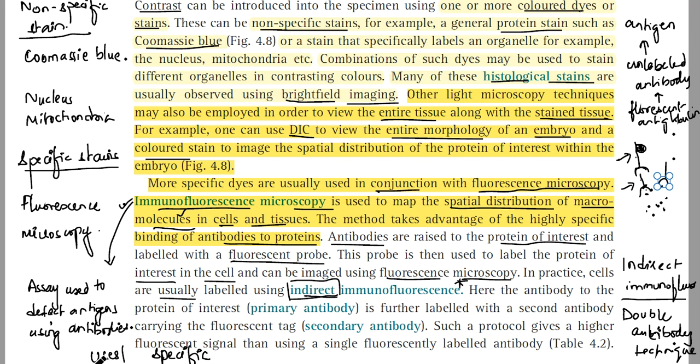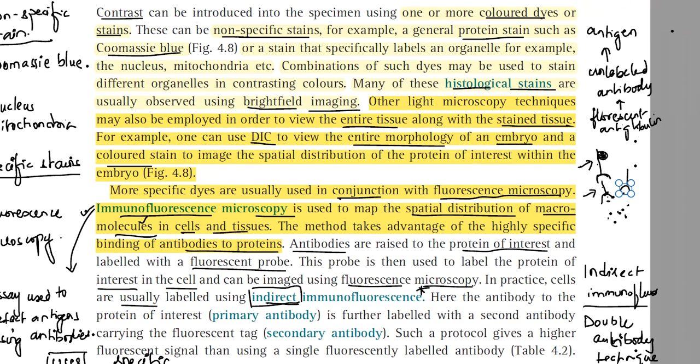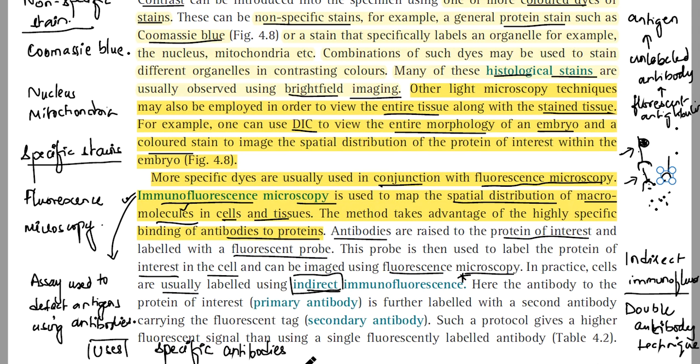I write here the uses. It is used for the detection of specific antibodies in the serum and other body fluids, for serodiagnosis of many infectious diseases.